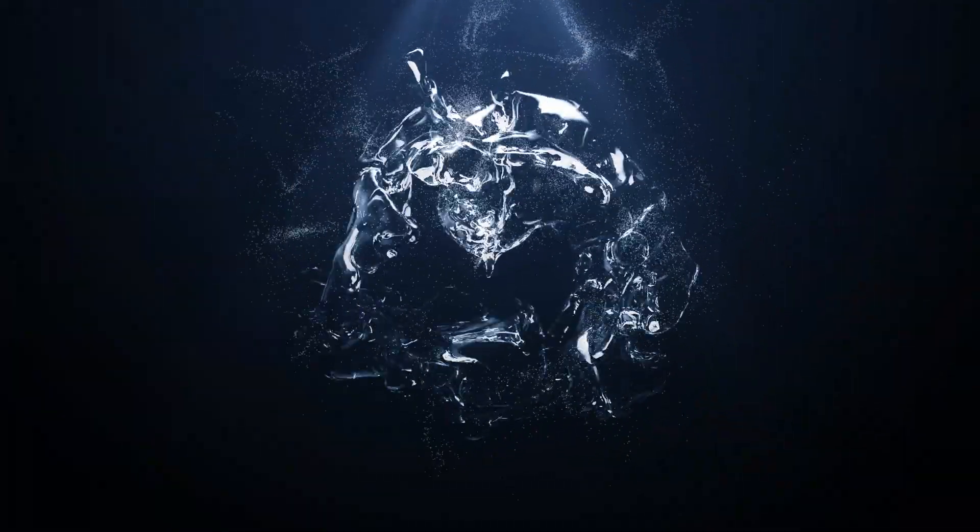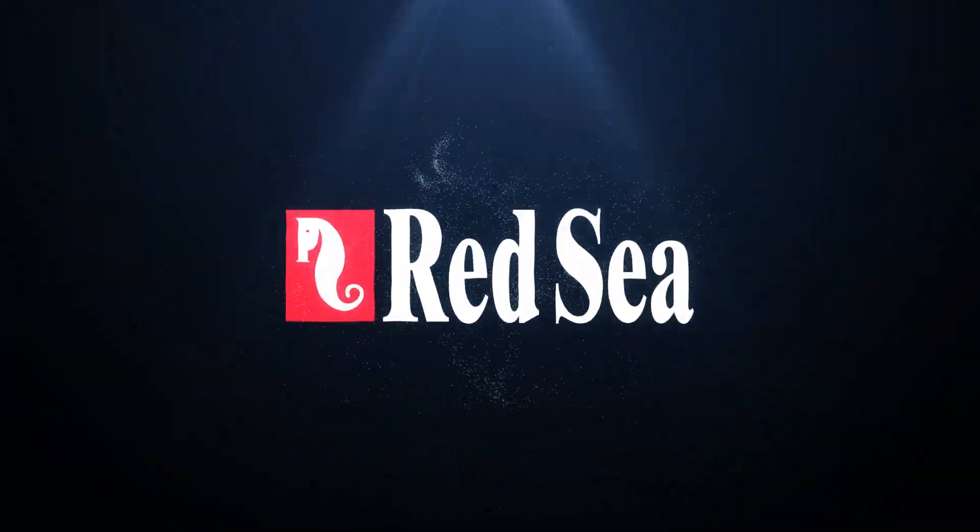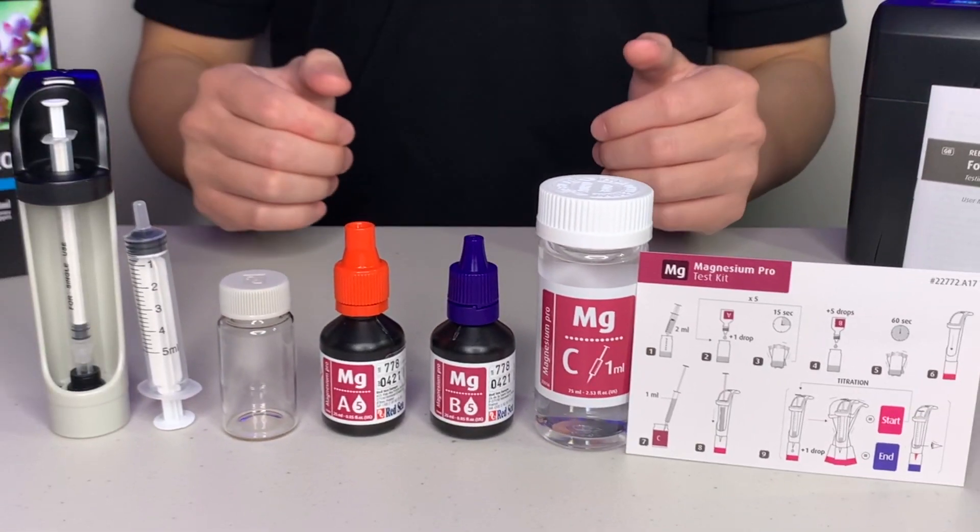Hi, I'm Lee. Today I'm going to show you how to use the Red Sea Magnesium Pro test kit. Here's what comes in the box.